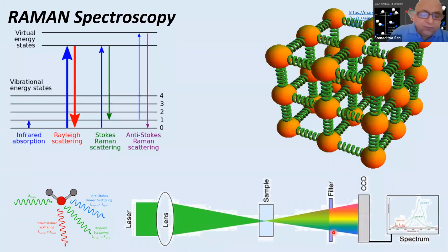Now, moving on from here, we need to know what the atoms are doing inside the lattice structure. A very important discovery from our famous Indian scientist Sir C.V. Raman was the Raman effect. The Raman effect is a way to understand the lattice vibrations or the phonons in a material. What are phonons?